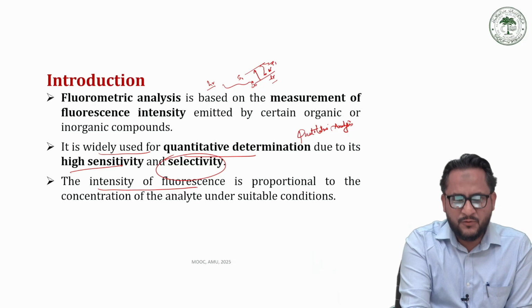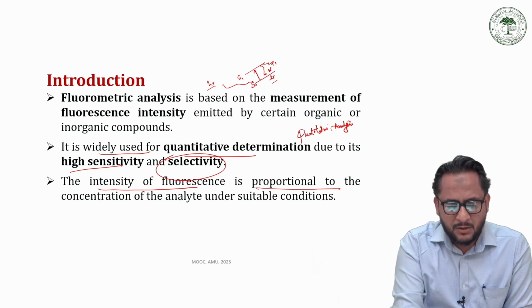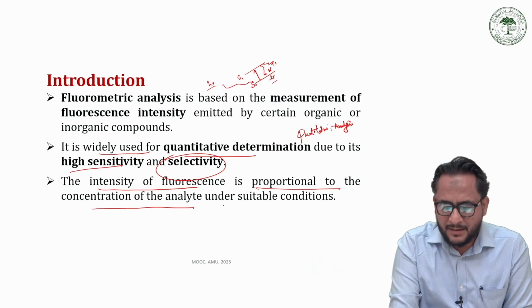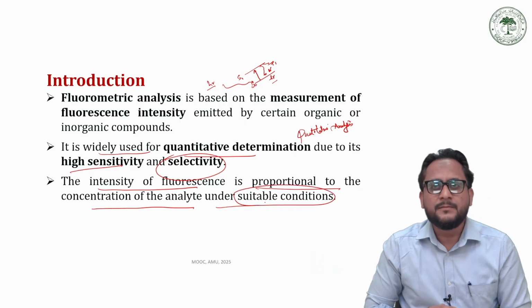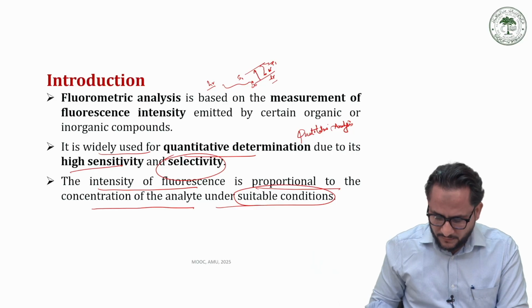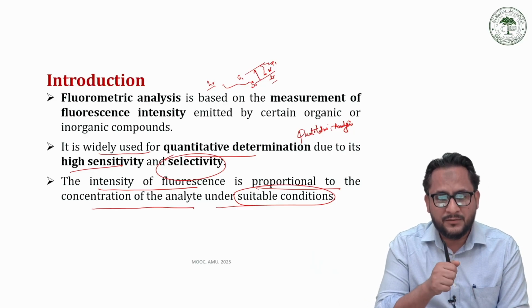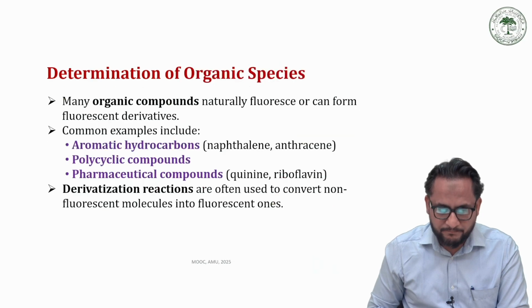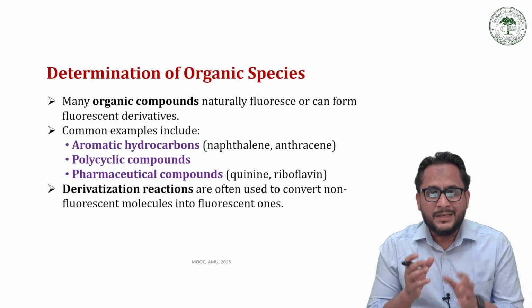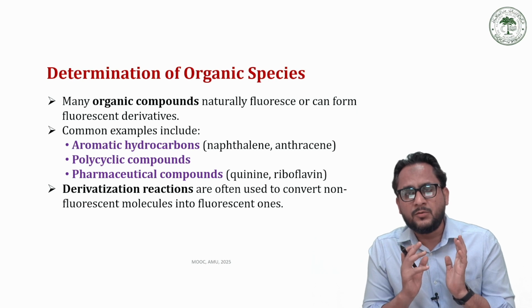The intensity of the fluorescence light that is being emitted in the visible region is proportional to the concentration of the analyte under study. So we can do quantitative as well as qualitative analysis. Now, these methods can be applied to organic as well as inorganic molecules.